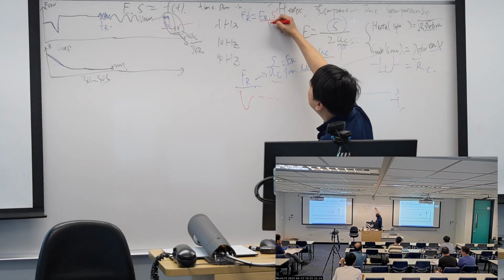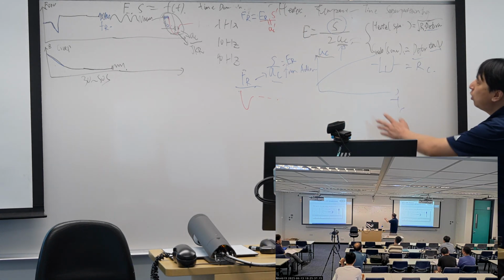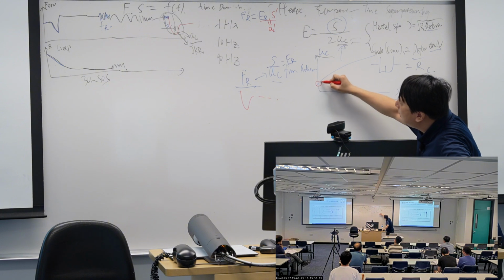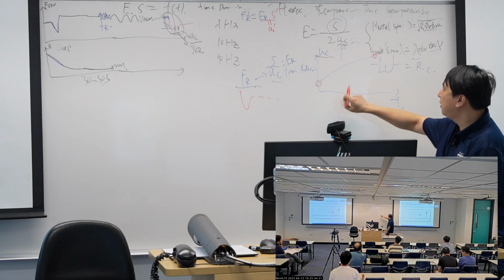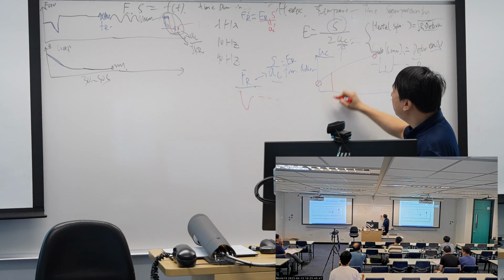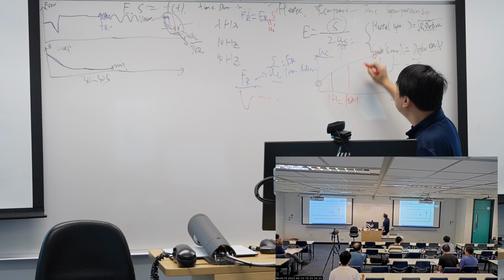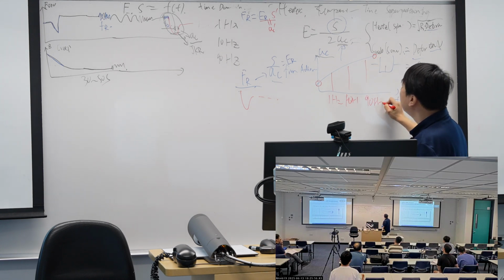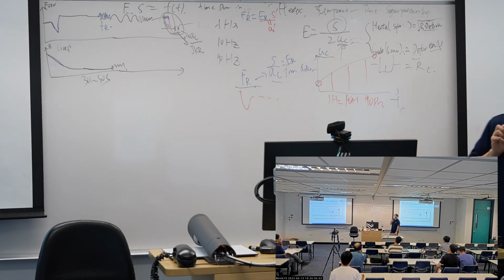So I have the AC at the beginning, I have the AC at the end, and I have the AC against the time curve. Then I can tell the AC at 1 Hertz, 10 Hertz, and 90 Hertz from this curve. That's our idea: using the reference frequency to define the AC change against time.